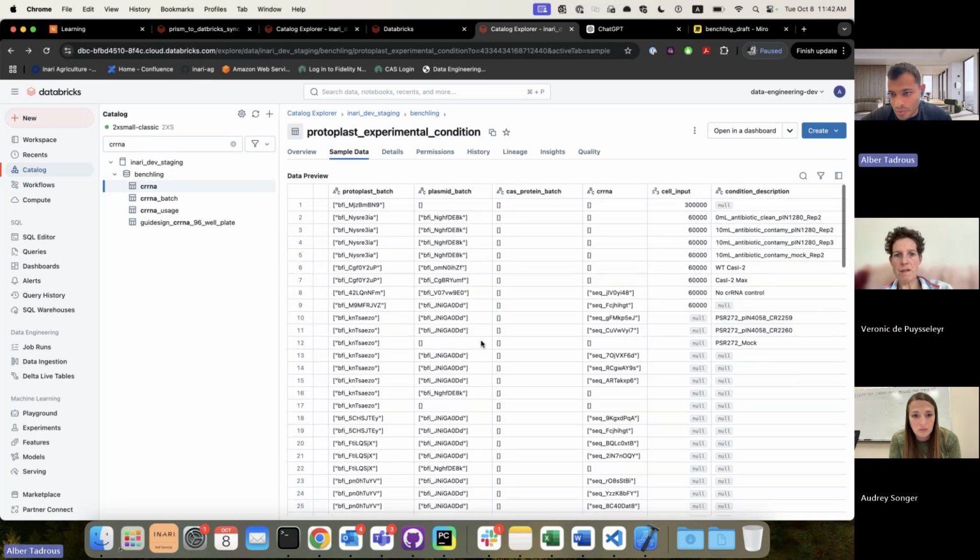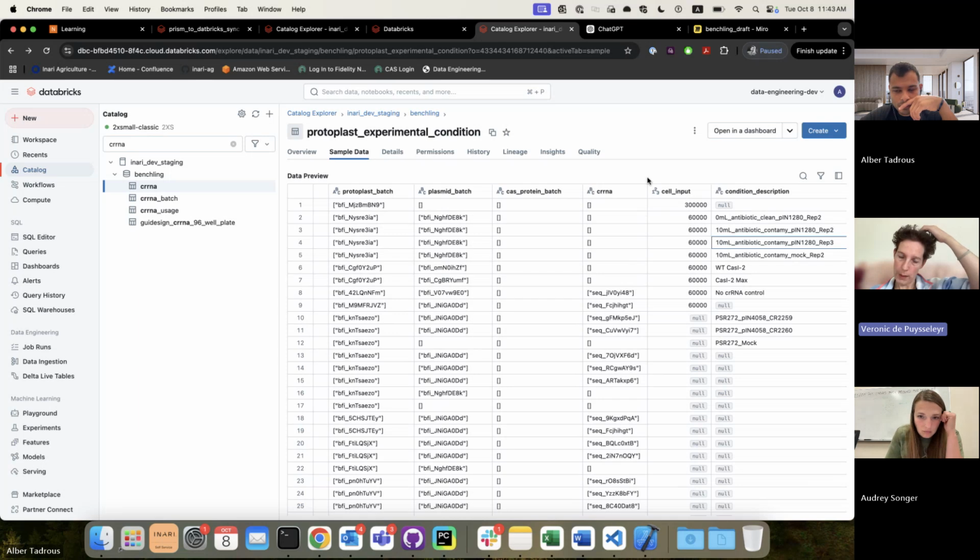No, I mean, do you want it or not? Yes, it's needed because it sometimes discriminates rows. Otherwise, you will not have unique rows. When all the other columns are the same, but they test, for instance, a different way to seal their plate, then you need to have the condition description to discriminate. So yes, we'll include this.